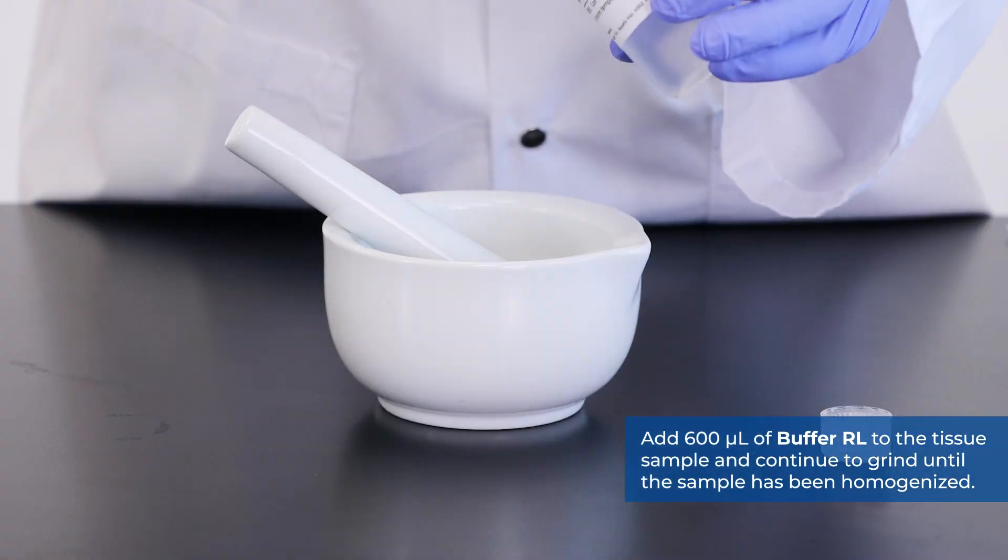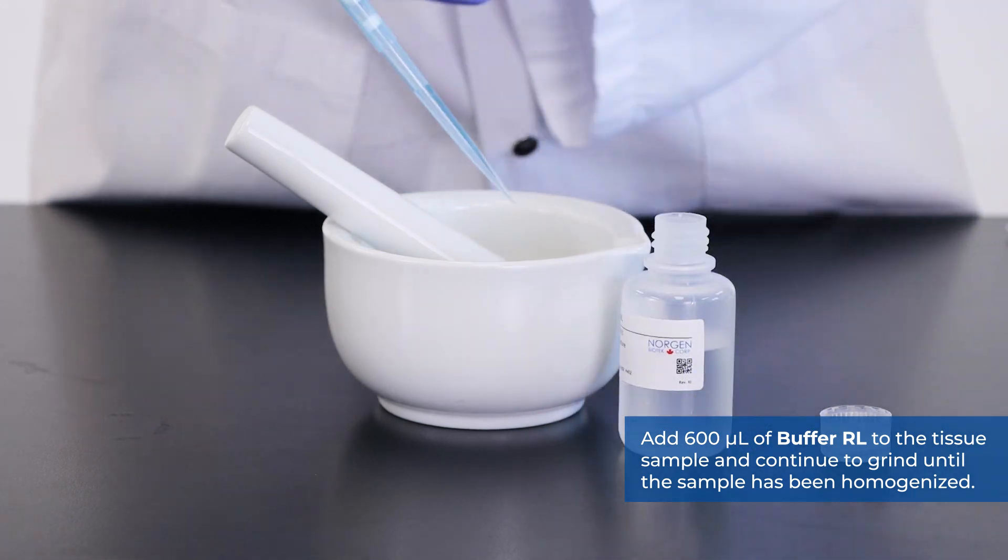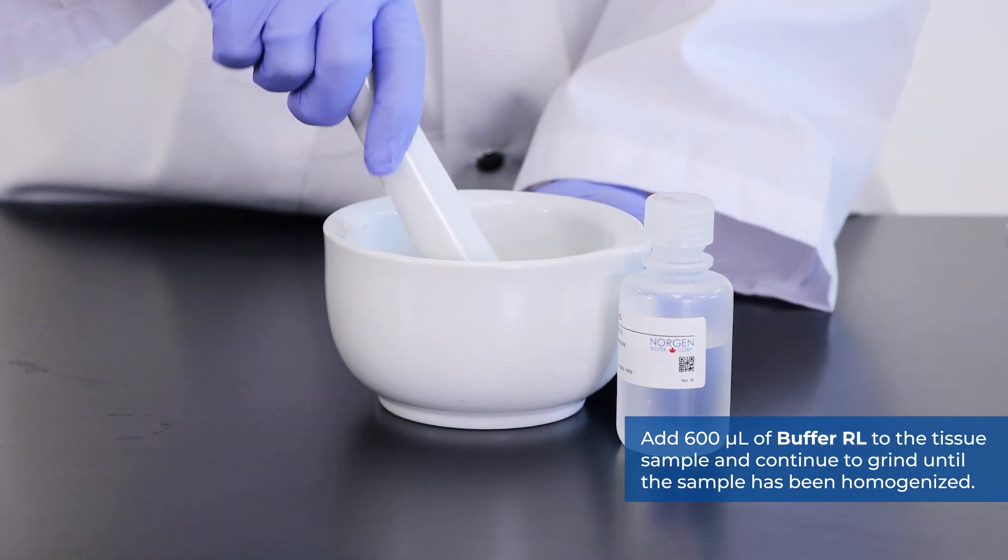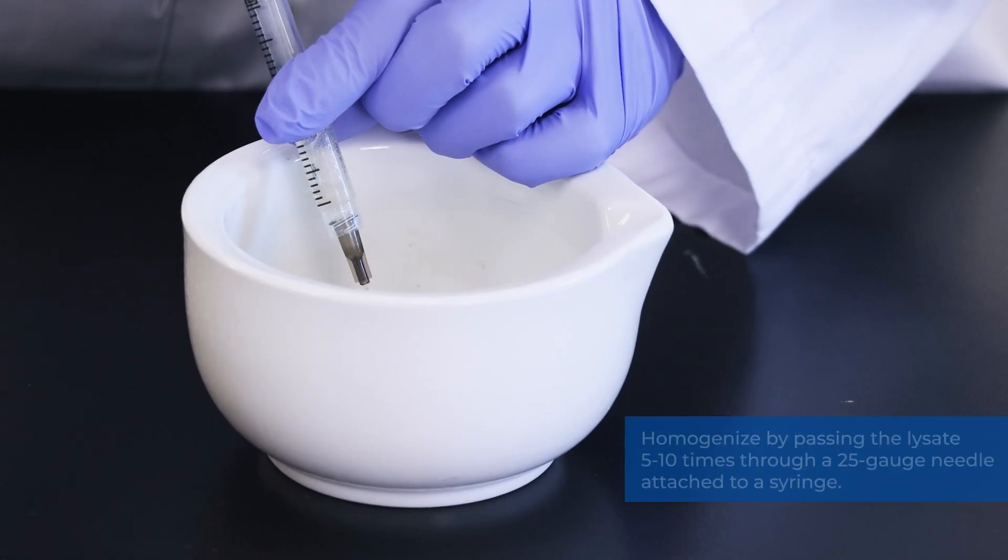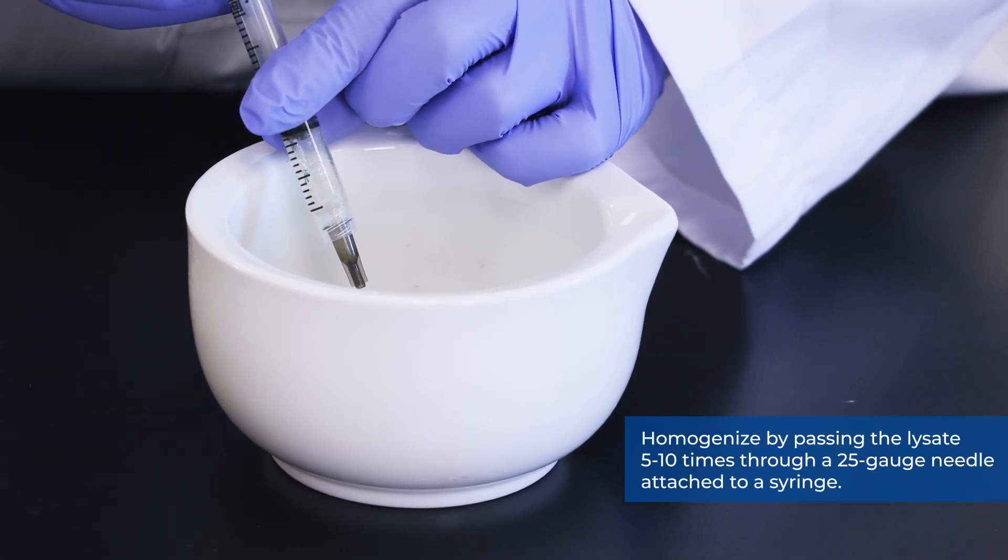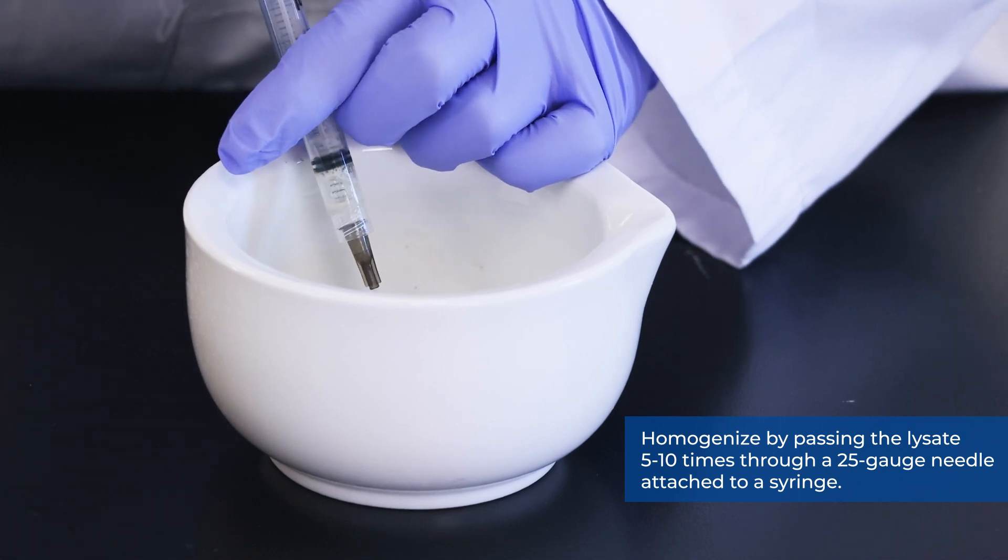Add 600 microliters of buffer RL to the tissue sample and continue to grind until the sample has been homogenized. Homogenize by passing the lysate 5-10 times through a 25-gauge needle attached to a syringe.